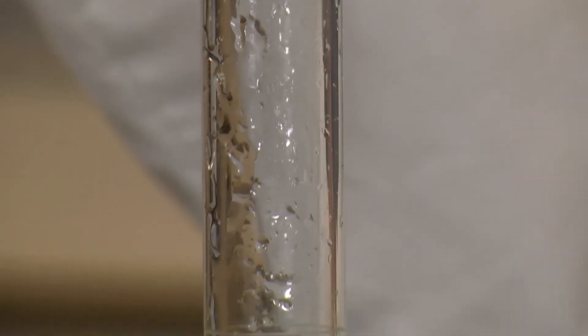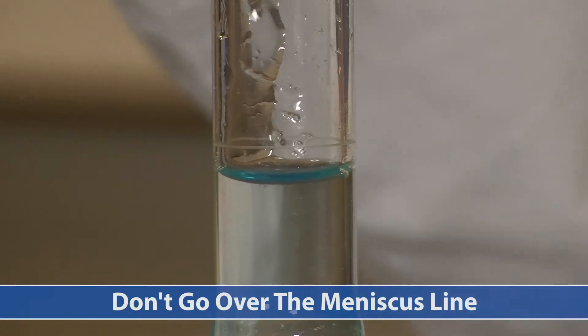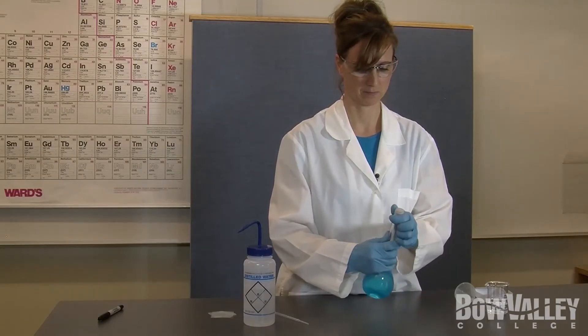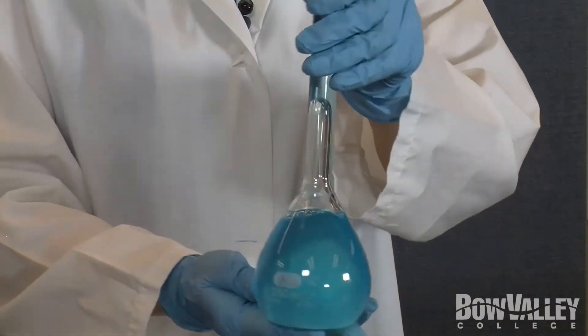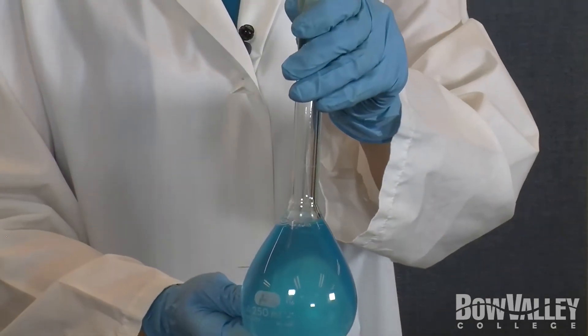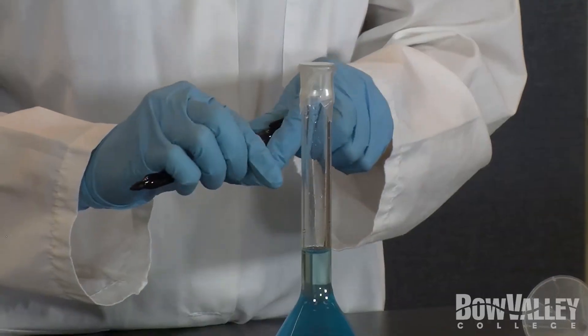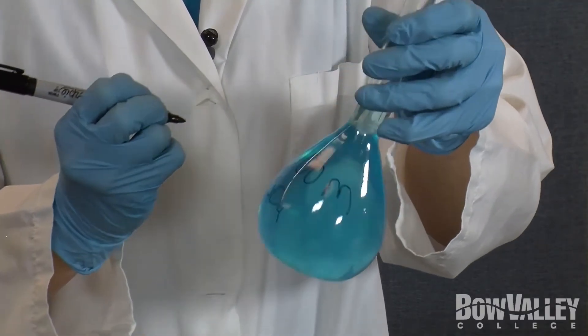On this step be careful, you don't want to go over the meniscus line otherwise you'll have to do it all over again. Seal the flask with a small piece of parafilm. Invert the flask several times to ensure thorough mixing. Now label the flask with the name and concentration of the stock solution. You have now made a stock solution.